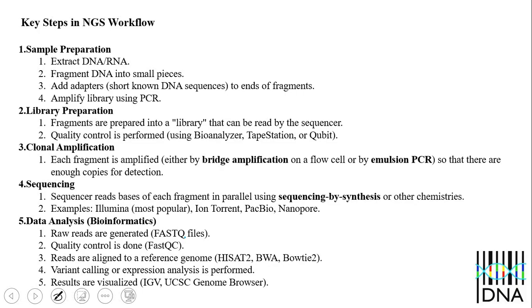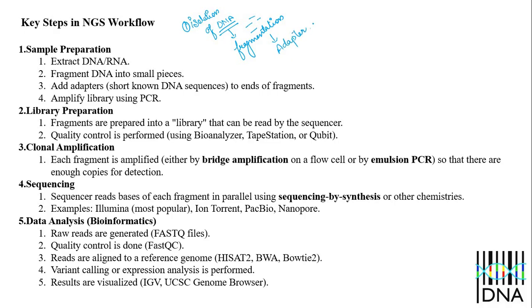Now we understand the workflow. First step is isolation of DNA or RNA, which is your target molecule. Then fragmentation, which means we fragment this DNA into small fragments. Then we add adapters at both the 3' side and 5' side. Then PCR. Okay, then our library is prepared.